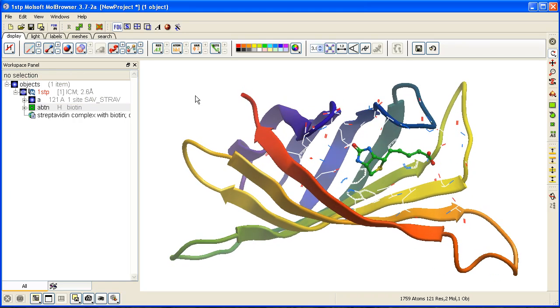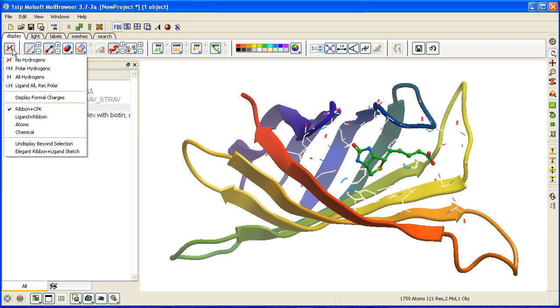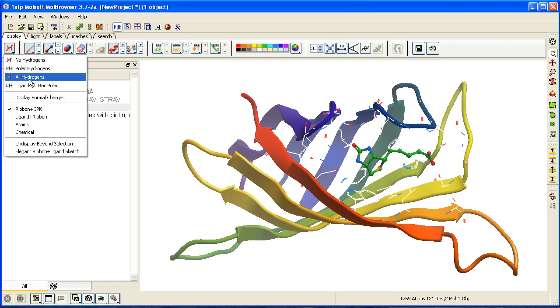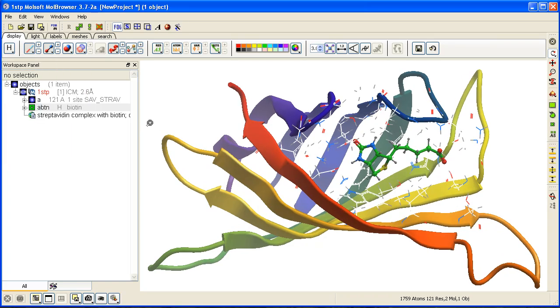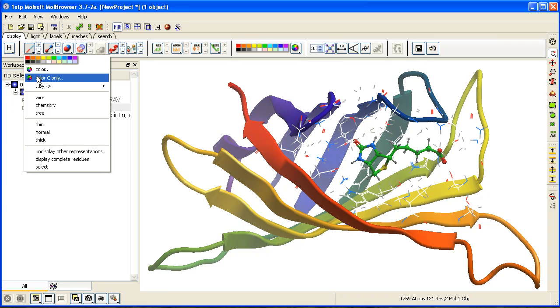To display the hydrogen bonds, we can display the hydrogen atoms. Click and hold on the hydrogen button here and select all hydrogen. For clarity, I'm going to recolor the wire a different color.